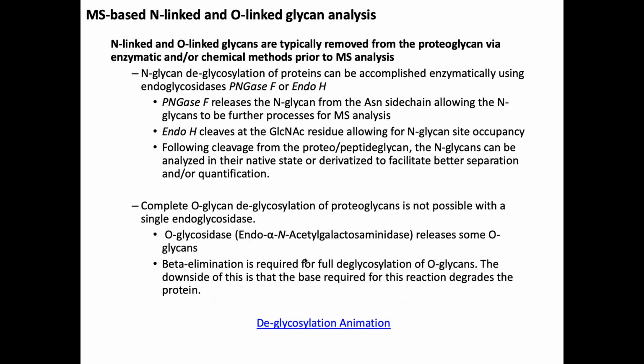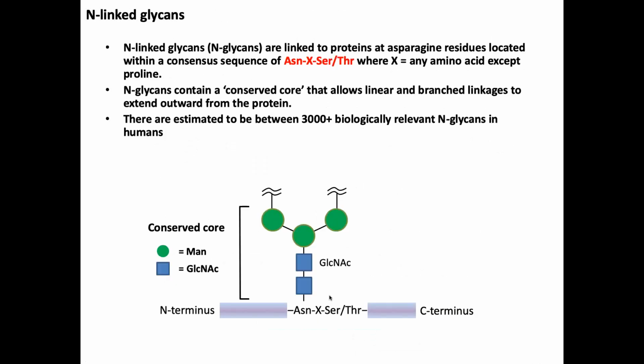So let's look at some of these release chemistries which are commonly used. This is a hyperlink I won't go to, but this is off of NEB, which is a nice website to show this animation and pulls everything together. Perhaps if you're not super comfortable with my delivery, the animations always help.